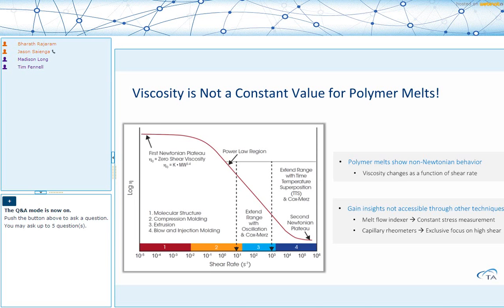So called out on this plot are two techniques. So when measurements are made on a rotational rheometer, we tend to apply a steady shear and make the viscosity measurement. With polymer melts, there are some challenges, especially around polymer melt fracture as we get to higher shear rates. So there are two tools that are available to the rheologist that we can tap into to get a full flow curve spanning several orders of magnitude. And we look at these briefly in the following slides.